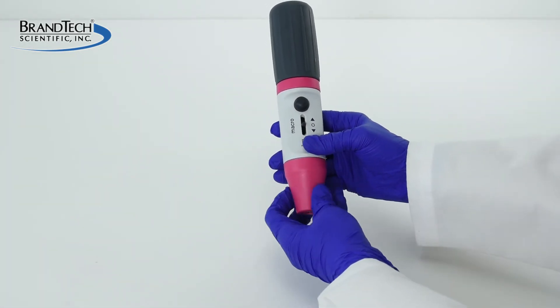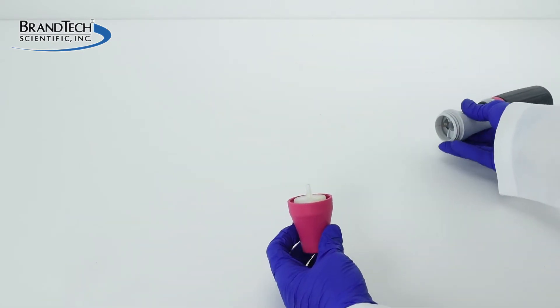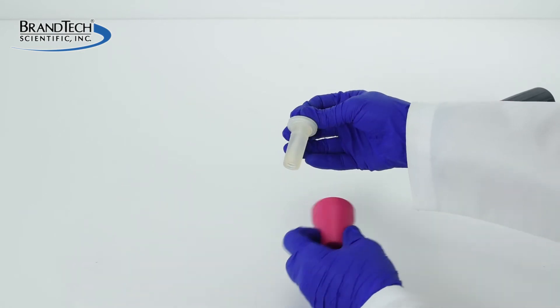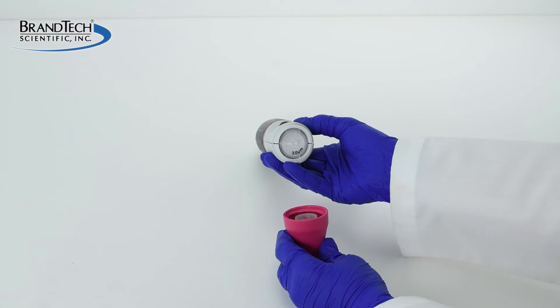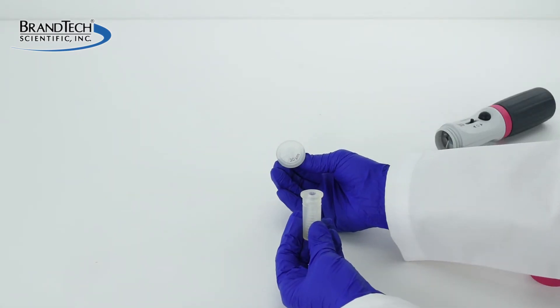Remove the filter from your Macro by grasping the adapter support and unscrewing it from the body of the Macro. The filter will most likely protrude from the silicone pipette adapter, but might possibly be lodged in the body of the Macro. Grasp the silicone fitting and remove the filter from the Macro.